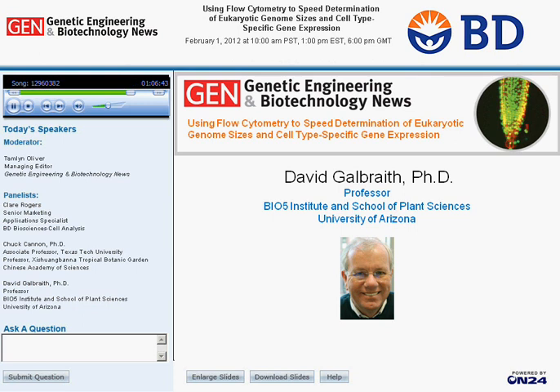Okay, someone wants to get some of your expertise on fixation, pros and cons. It seems I can get much more nuclei with fixed tissue. Yeah, I'd be very careful with the idea of fixation, because then you need to fix the controls to make sure that you're not perturbing the nuclei in any way. But that being said, you can certainly try it and see what happens, and compare unfixed to fixed and do a lot of standard experiments, and it may be helpful for you in certain circumstances. But most of what we do is with unfixed tissues.